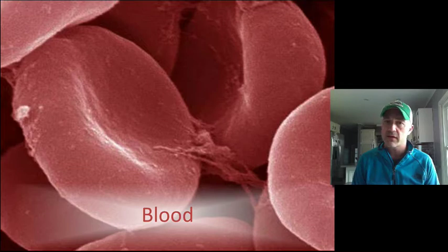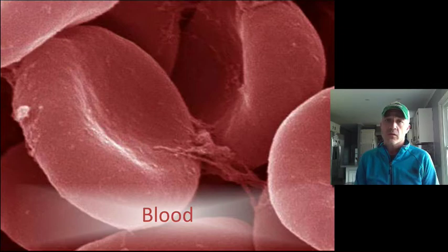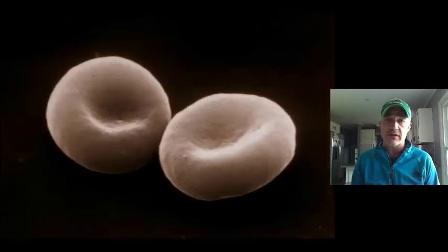So today I'm gonna lecture real quick about a few different types of the blood cells, and then, like I said, I'll probably also tape a little something and maybe tack it on to the end of this little lecture with doing some of the digitized slides and actually showing you a little bit more in the real setting like that. So blood is another one of the connective tissues that we've been talking about.